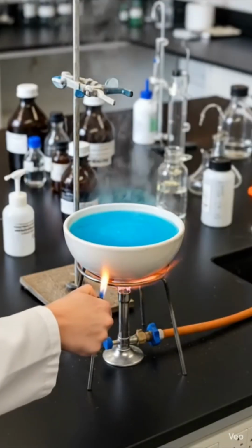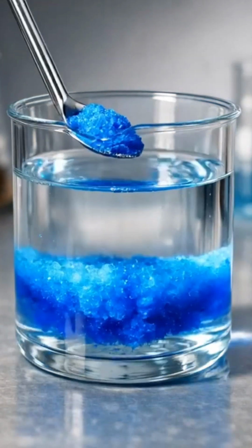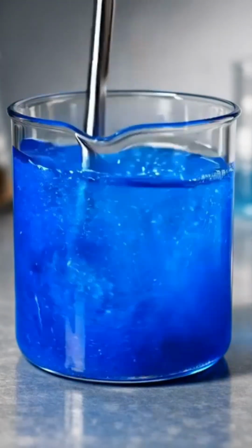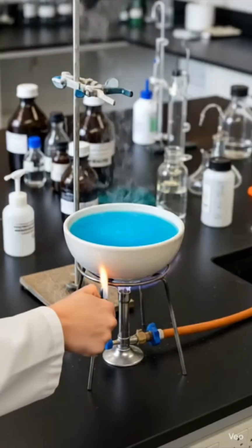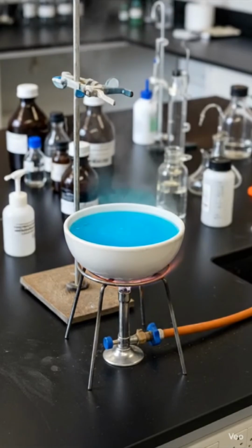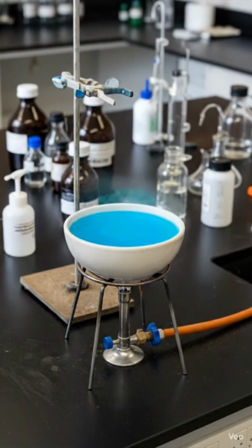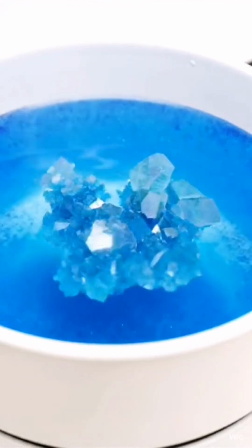Next comes crystallization. Now imagine salt or copper sulfate dissolved in water. You can't see the solid anymore, it's fully dissolved. To get it back, we gently heat the solution. As the water evaporates, the solution becomes more concentrated. Eventually, solid particles begin to form again, arranging themselves into crystals.